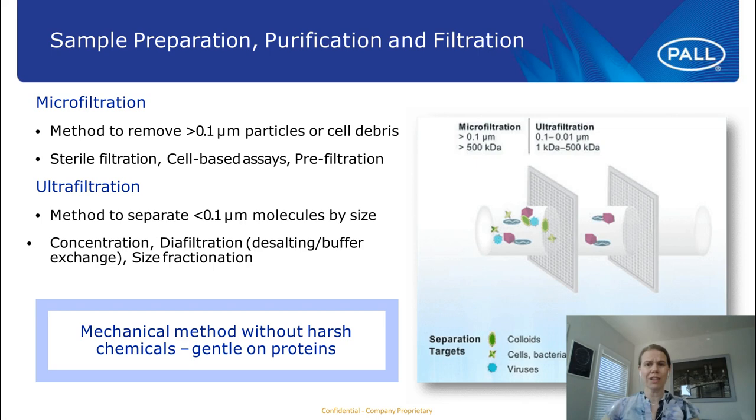Now, one of the biggest benefits of filtration is that the method is mechanical and does not require any harsh chemicals to remove or separate your molecules. This is a big thing, especially if you're working with nucleic acids or proteins, because you do not want to change your protein structure or function by using harsh chemicals in the filtration method. So indeed, filtration has a huge advantage compared to other separation methods that require harsh chemicals to be used.